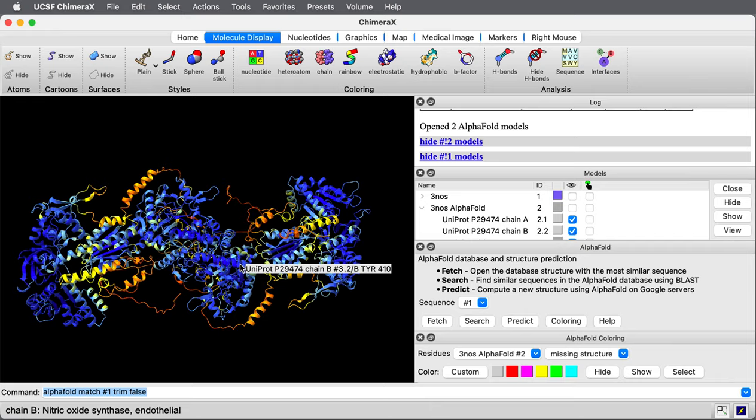That gives you an idea how to use structures from the alpha fold database in Chimera X. Thank you.